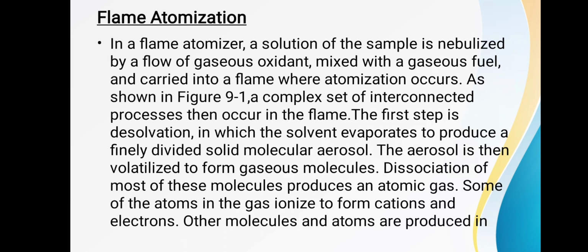Flame atomization. In a flame atomizer, a solution of the sample is nebulized by a flow of gaseous oxidant mixed with the gaseous fuel and carried into a flame where atomization occurs, as shown in figure 9.1. A complex set of interconnected processes occur in the flame. The first step is desolvation, in which the solvent evaporates to produce a finely divided solid molecular aerosol. The aerosol is then volatilized to form gaseous molecules. Dissociation of most of these molecules produces an atomic gas.